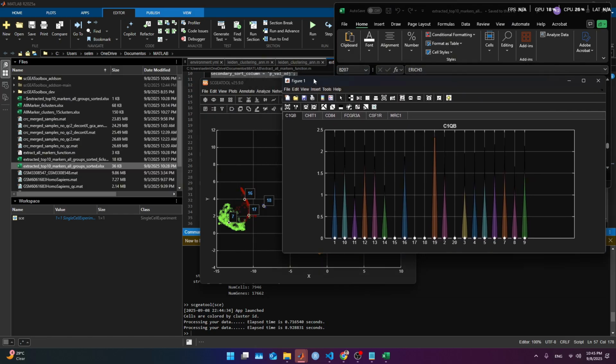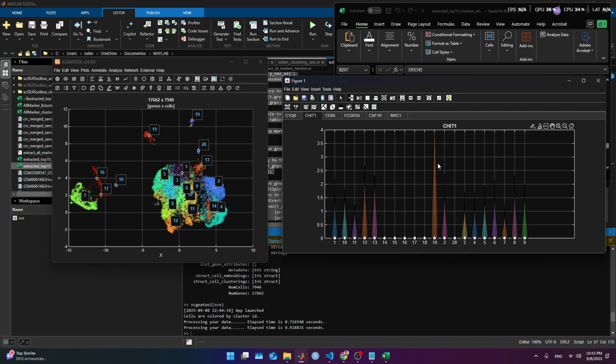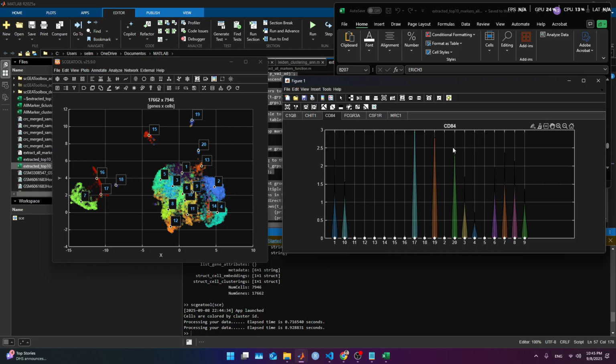Here we got to start inspecting what is potentially there. For example, 19 is pointing out as I wanted before. That's macrophage. Great, 19 is macrophage, and it's the only one. Yes, the second marker is lighting up in that. This one, CD84, we have to remove it because it's lighting up also the 17th.